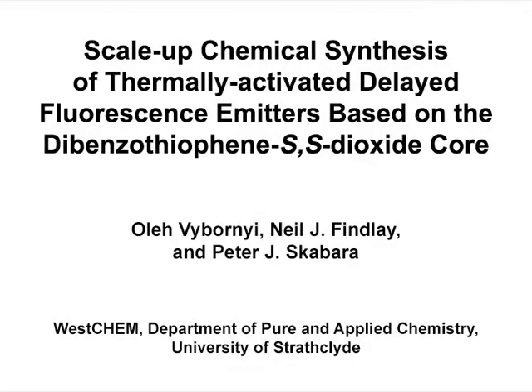The overall goal of this procedure is the chemical synthesis of highly efficient organic materials for organic light-emitting diode applications from commercially available starting materials. This method can help answer key questions in organic electronics about the use of thermally activated delayed fluorescence in lighting applications. The main advantage of this technique is that it uses readily available materials and is accessible to researchers with little experience in synthetic organic chemistry.